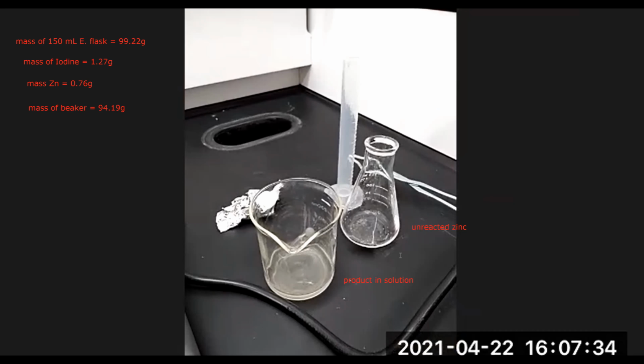So that's the difference between the two. Now we're going to put them on the hot plate and dry out the unreacted zinc and evaporate off the methanol in the beaker.